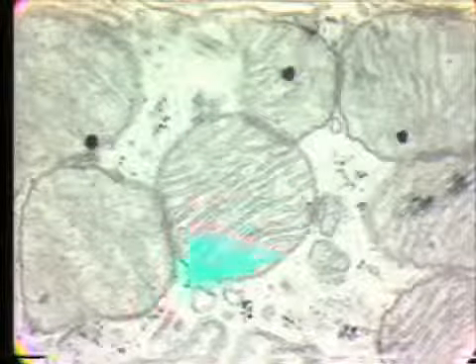Here in a higher power, we have an individual mitochondria. It has an outer membrane bounding it, and then there are individual cristae that run throughout the mitochondria. It's on these cristae that is the location of the enzymes that produce ATP, the energy source of the cell.